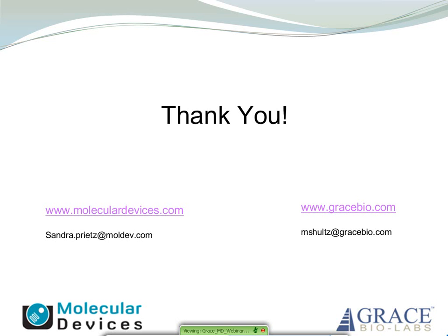Do you know of any low evaporation array buffers for proteins? Typically, a lot of people will put glycerol in their spotting buffers to minimize evaporation during spotting. It really does depend on the substrate as well as the sample type. Some people use DMSO, betaine for controlling evaporation, but it really depends on the compatibility with your substrate as well as your sample type. So, for example, DMSO is not compatible with porous nitrocellulose films, and you wouldn't want to include that in your spotting buffer, but it is very commonly used for glass or planar glass substrates. So the answer will vary, and it really does depend on compatibility.